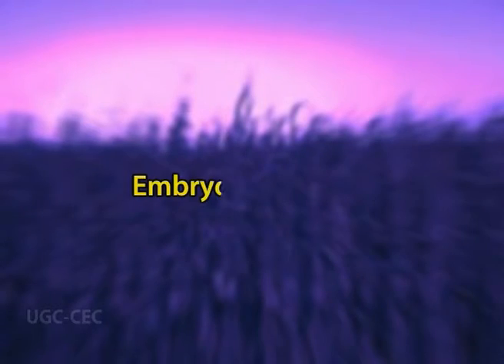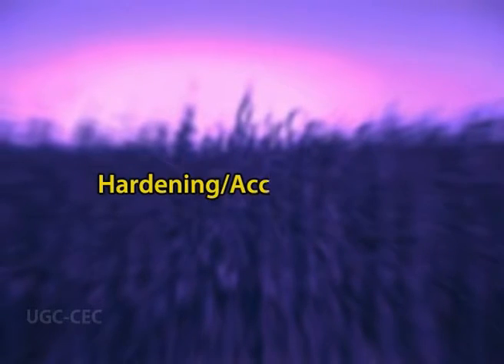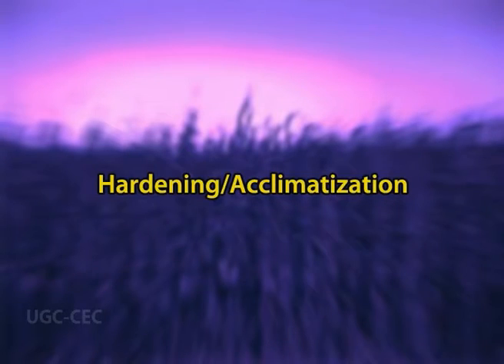The second stage, which is the stage of embryo production, is one in which the medium is supplemented with no or very low levels of 2,4-dichlorophenoxyacetic acid.